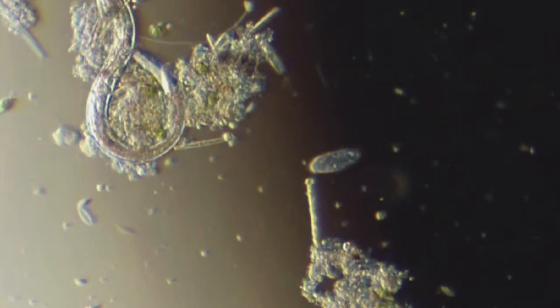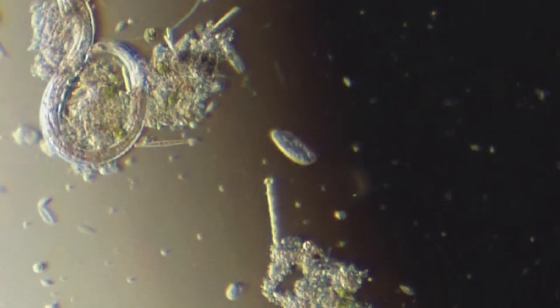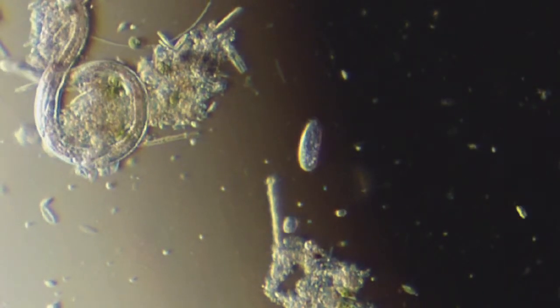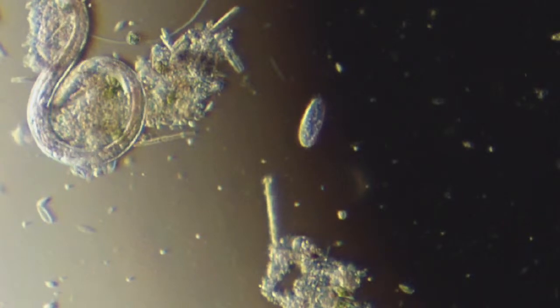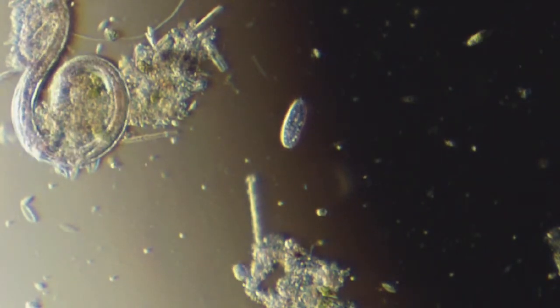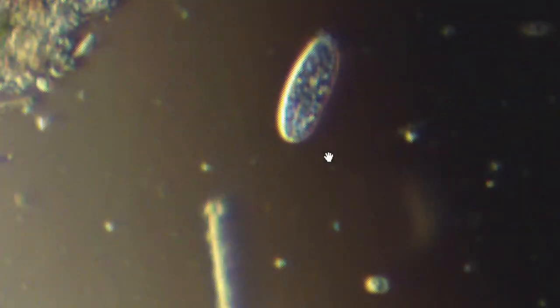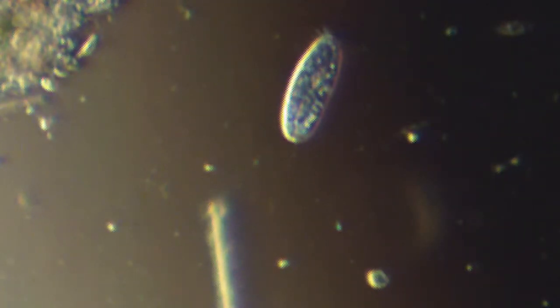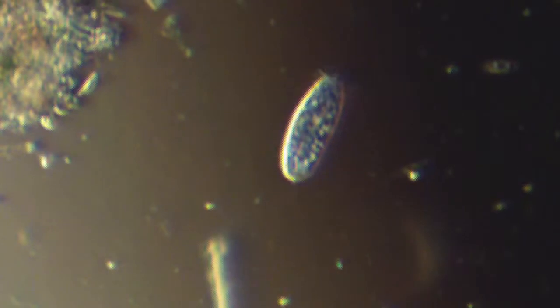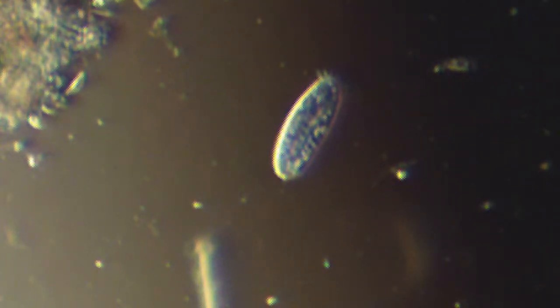And that looks like a Stylonychia there. See the longer capsule-shaped body and those little cirri on the ends? Those are nice. Let me zoom in a tad, because I don't want to change objectives yet. Might lose some of my clarity, but you can see it a little bit better. So there's all kinds of goodness going on inside there. It's a very sparkly looking active cell.